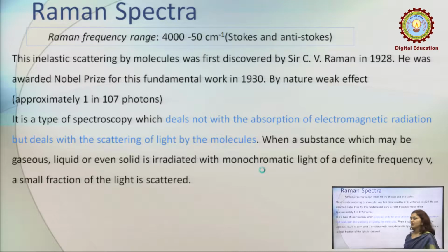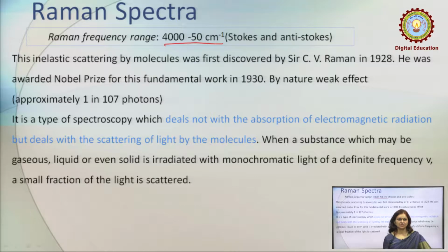Now come to the introduction of Raman spectroscopy. The frequency range of Raman is around 4000 to 50 cm inverse for both Stokes and anti-Stokes.